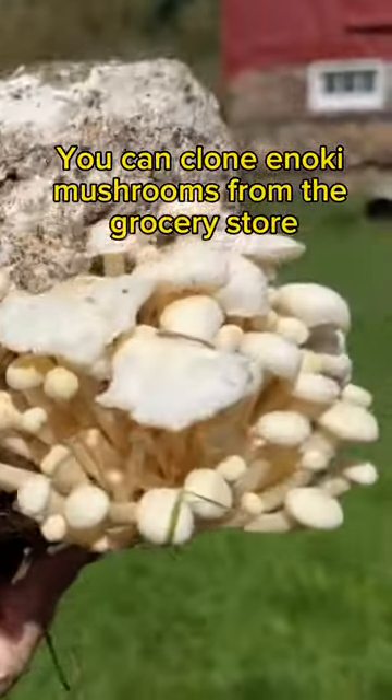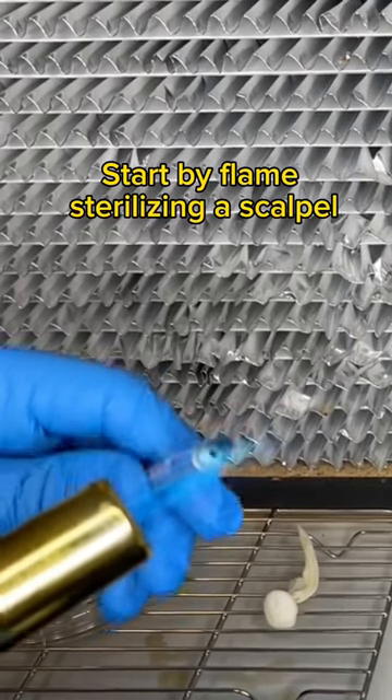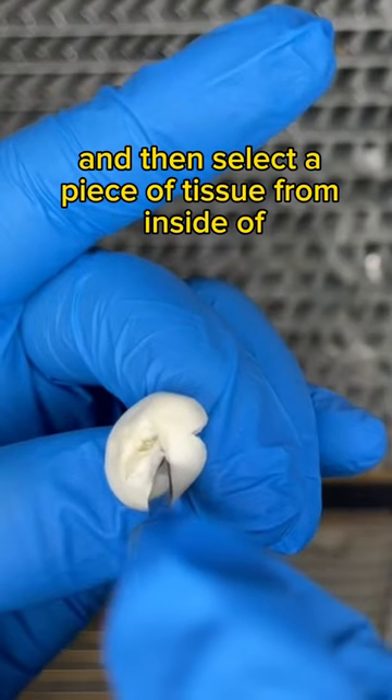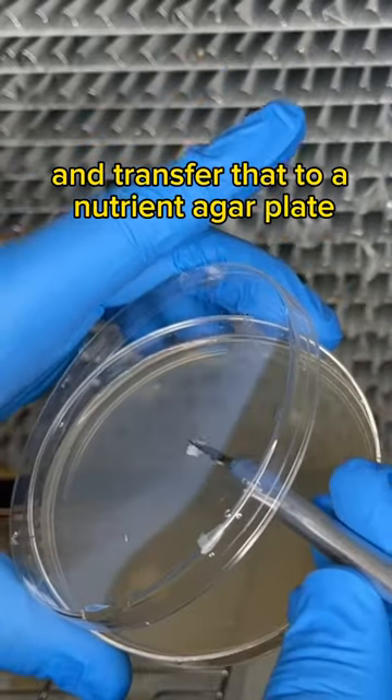You can clone enoki mushrooms from the grocery store and grow them at home. Start by flame sterilizing a scalpel, then select a piece of tissue from inside the mushroom cap and transfer it to a nutrient agar plate.